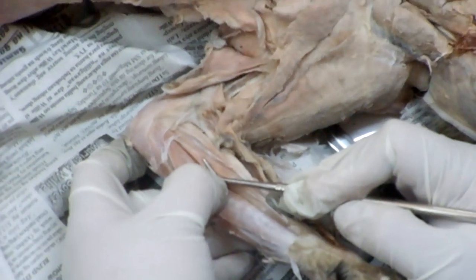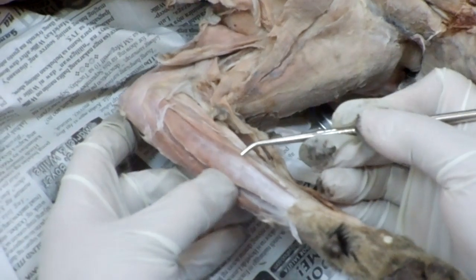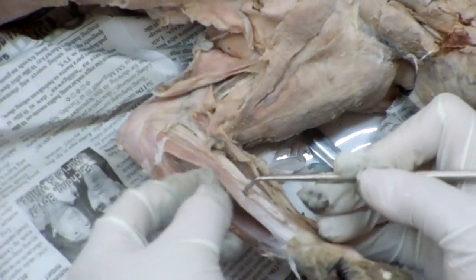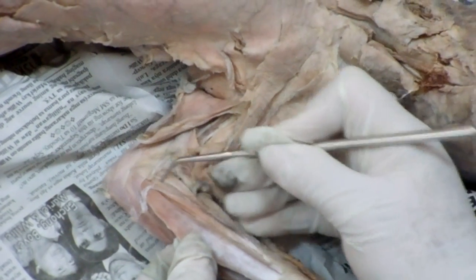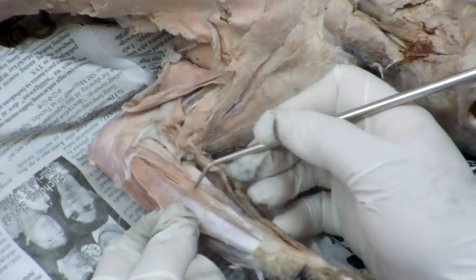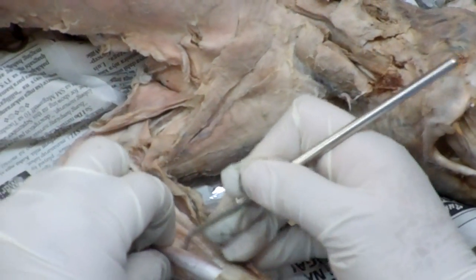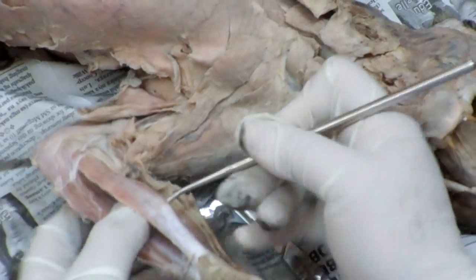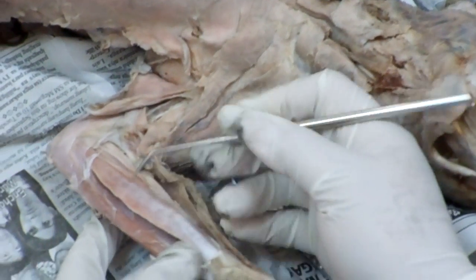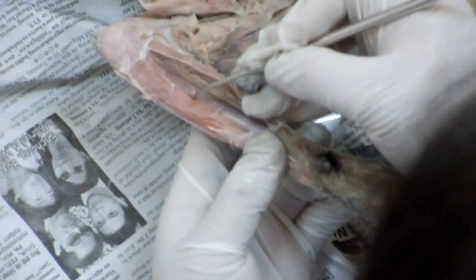Next, palmaris longus. Flat muscle next to the preceding. Origin: medial epicondyle of the humerus. Insertion: flat tendon passing to the wrist ligaments. Okay, ito na yung palmaris longus, the flat muscle. So, palmaris longus.